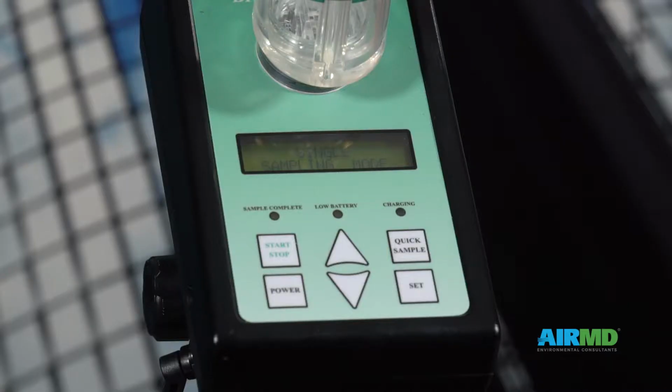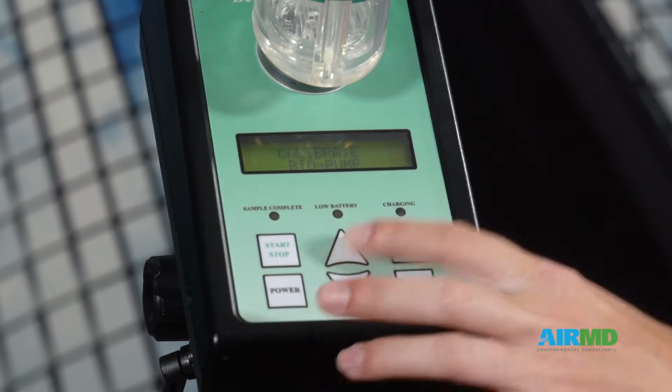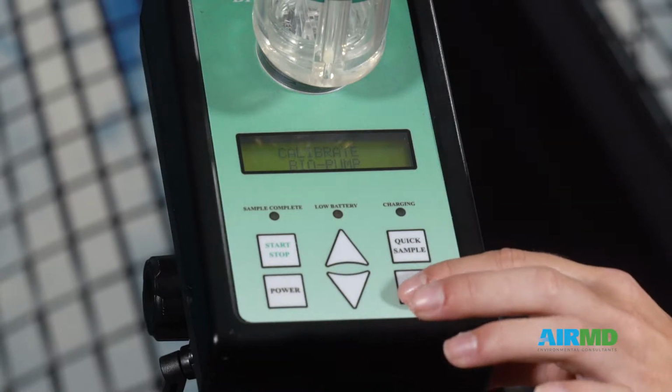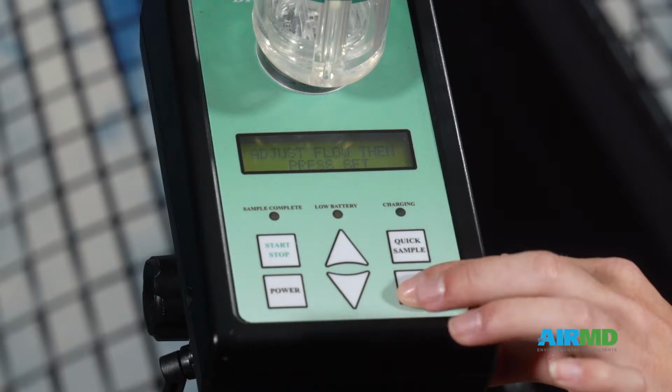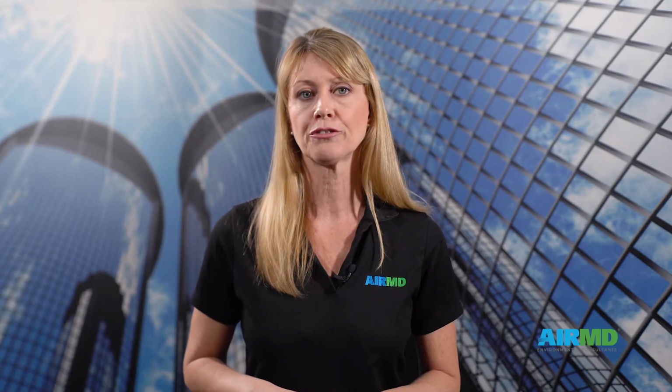Using the pump menu, choose the calibration mode on the pump by using the up and down keys. Once the calibration option is found, press the Set button. This will choose the pump flow rate screen, where the flow rate can be adjusted. The desired flow rate for air sampling for mold is 15 liters.